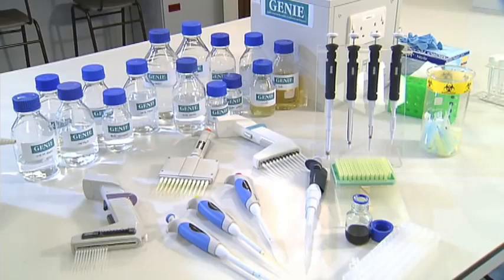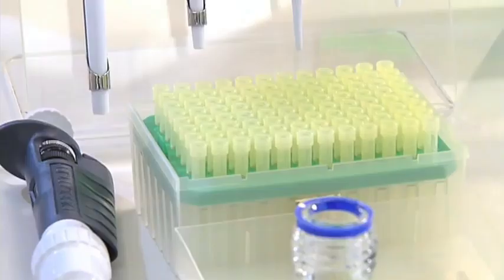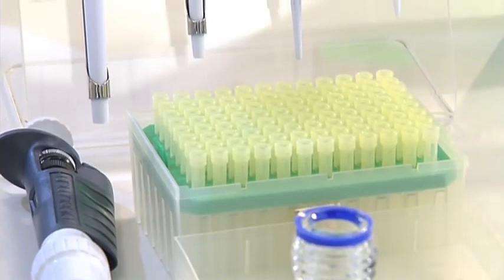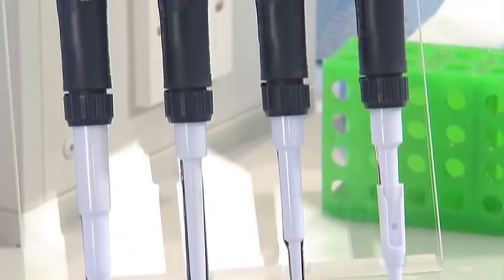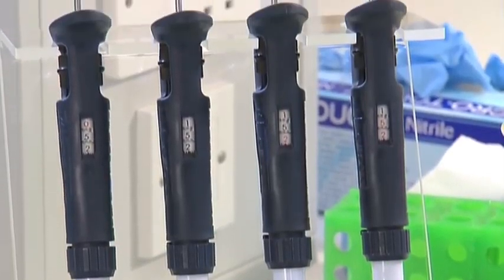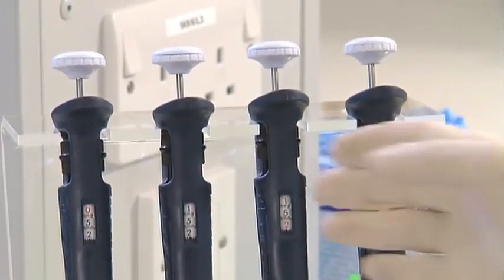Gilson or Finn micropipettes are one of the most commonly used instruments in a molecular biology laboratory. They're used in conjunction with plastic disposable pipette tips to measure or transfer small amounts of liquids, usually from 0.2 microliters to 1,000 microliters or 1 milliliter.